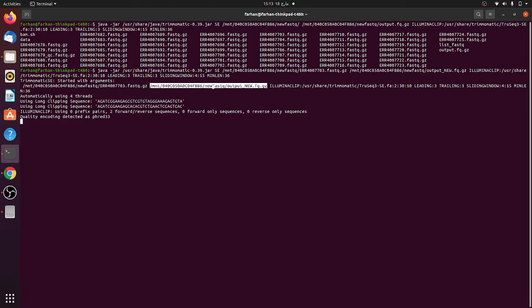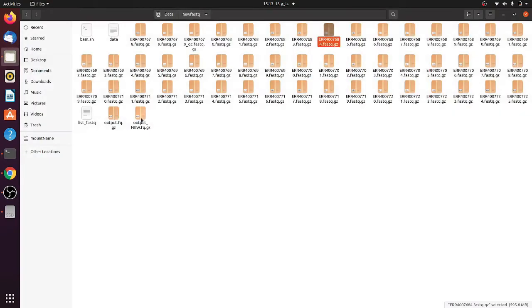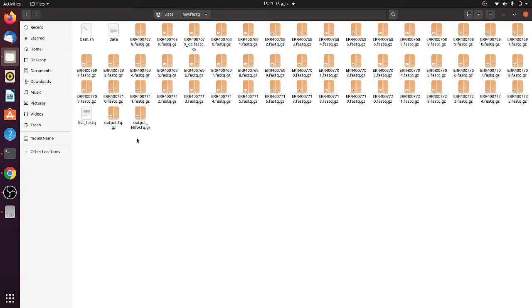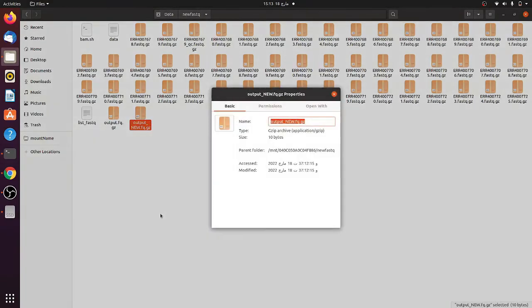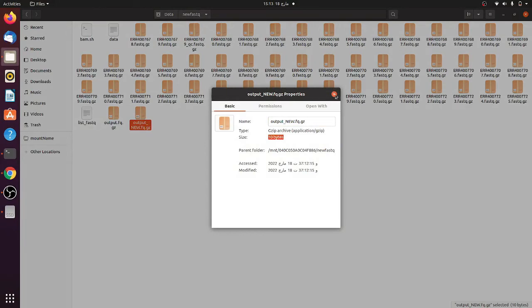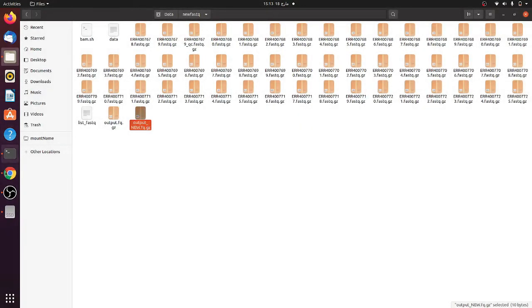This is saved here in new FASTQ. If we go here we can see this output new file is actually saving here. The size is very small, like right now 10 bytes, because currently the file is running. When it will be done it will be saved here in the FASTQ file. Let's wait for a while and then we will come back with the results.